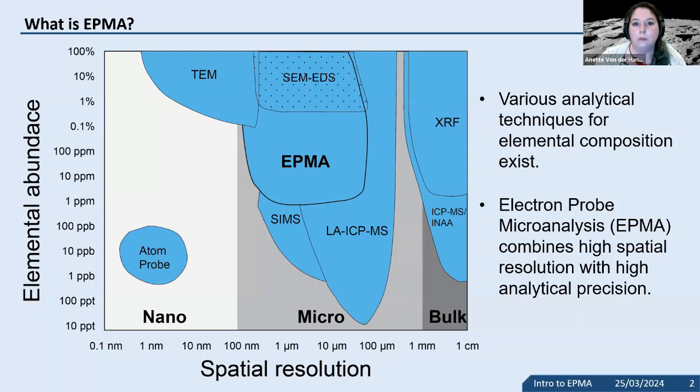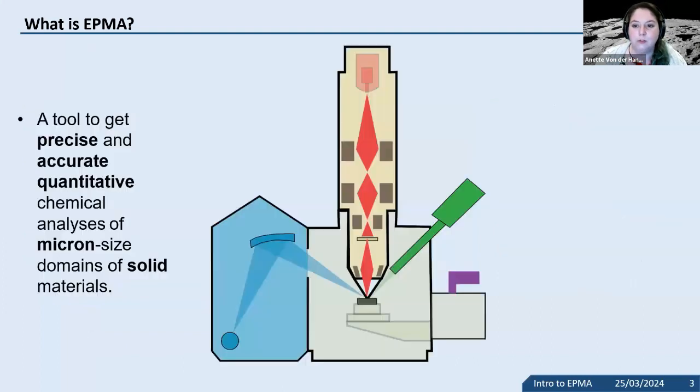And so this makes microprobe really a very common tool in a lot of material science and earth science departments.